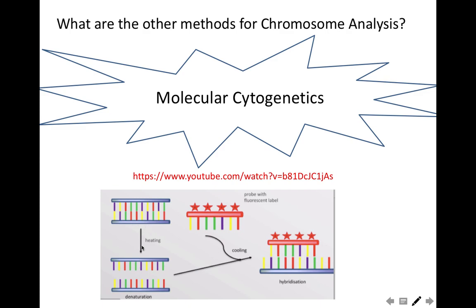Okay, so if we want to detect the presence of this segment, we will prepare a probe, and this probe is going to be complementary to one of the two strands of the DNA, and this part of the DNA during the preparation will be denatured, which means that by heating, the two strands will move apart from each other by breaking the hydrogen bonds between the bases of the DNA.